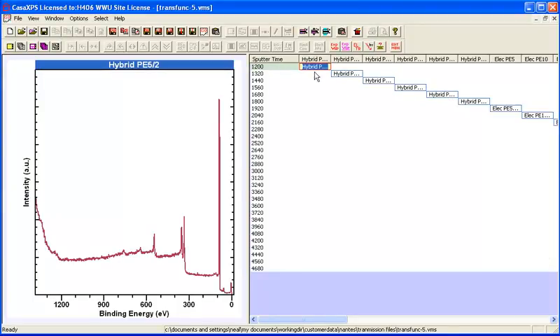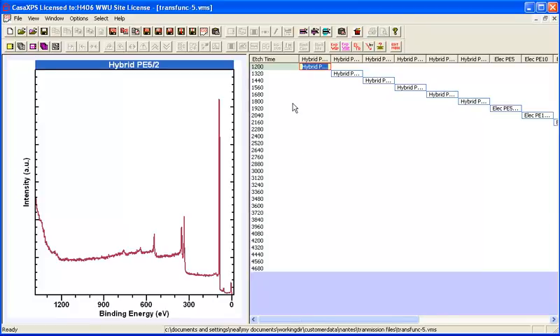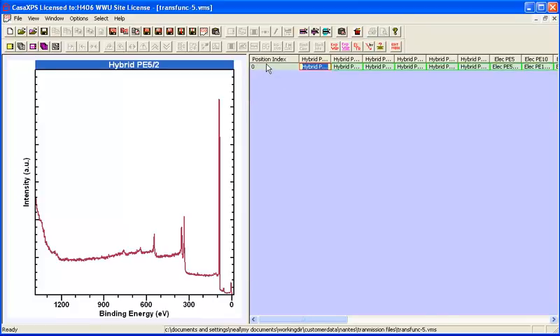These data have all been sputtered to maintain a clean gold surface, so you see a sequence of sputter times. But equally, if you look at the position, they were all measured at the same position. This is the type of information that's within these CAL files that can be used to construct the VAMAS files.